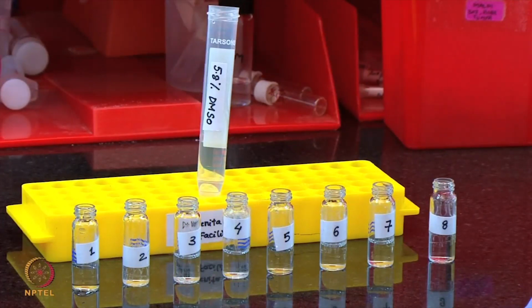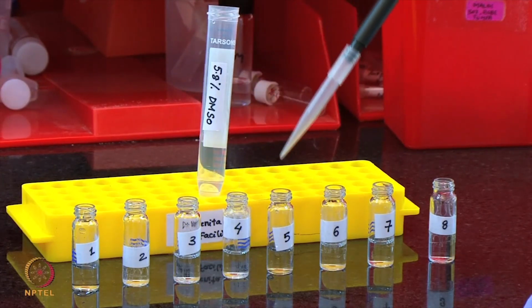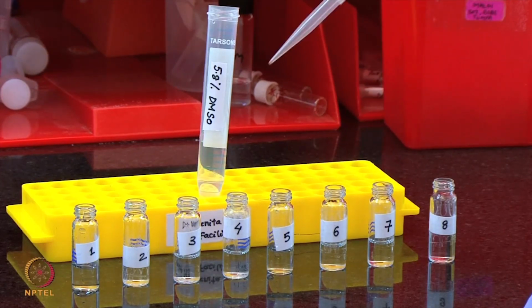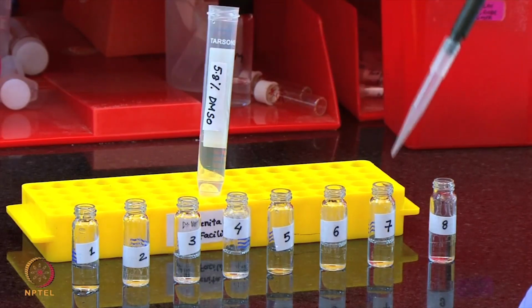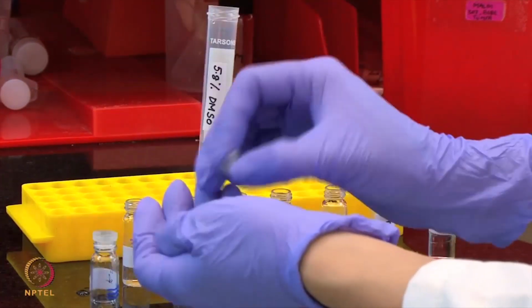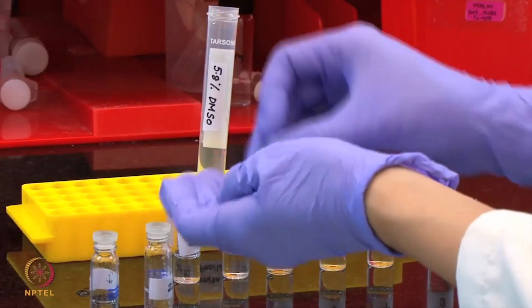Following this, we will add 1400, 1200, 1000, 800, 600, 400 and 200 microliter of 5.8% DMSO in tubes 1 to 7 respectively. We will mix these solutions vigorously and put the lids on and keep them in dark until we are ready with other samples.